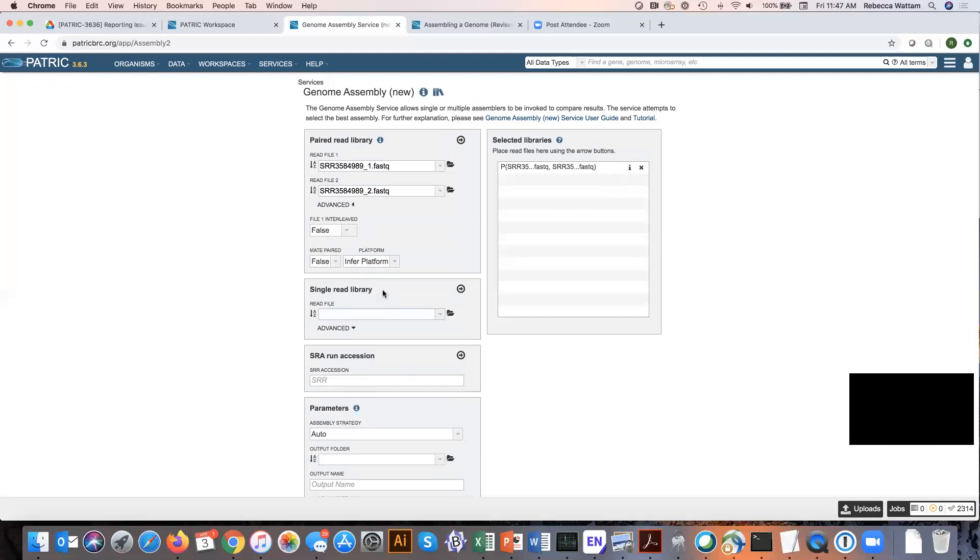Single read library. Now you can combine paired and single read together. You could combine a number of paired read libraries. Imagine often with sequencers, the technician will load the same sample in a number of lanes in case one fails, so you can have multiple backups. You could combine all of those to get greater coverage of your data.